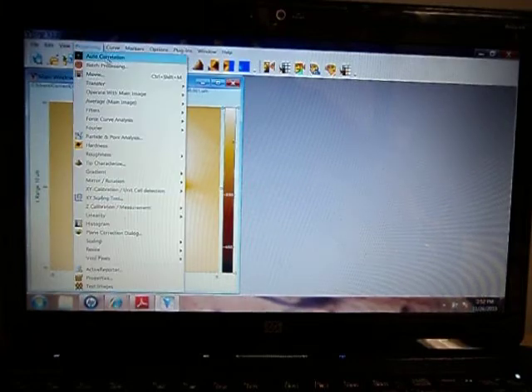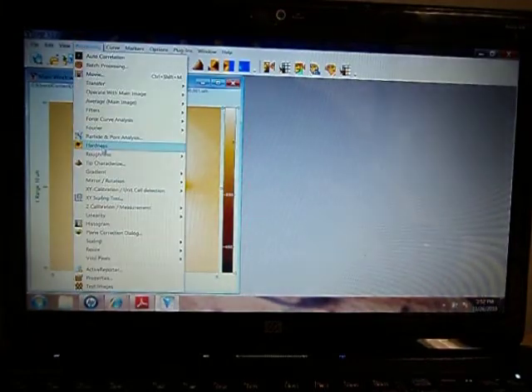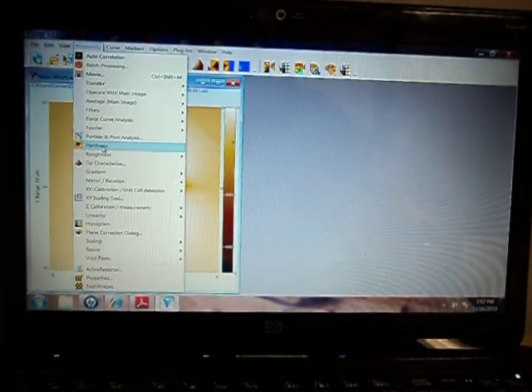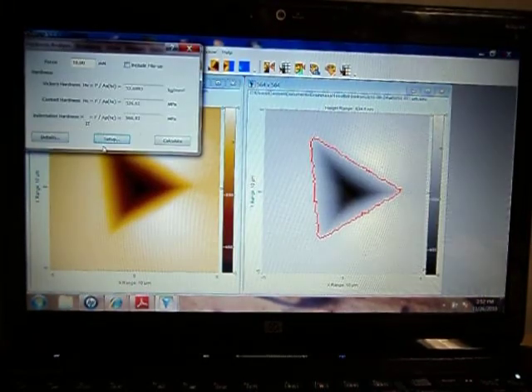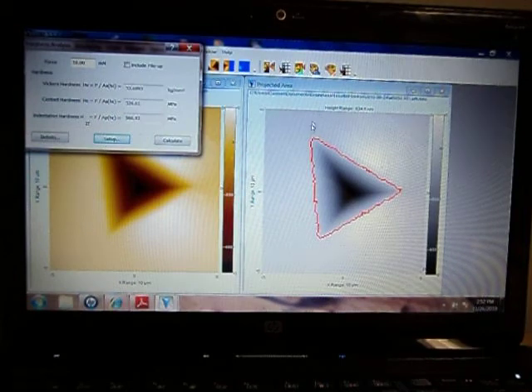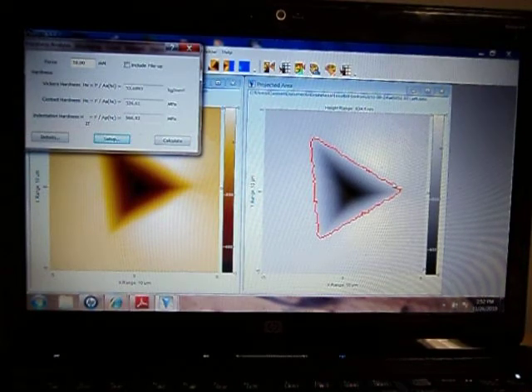To begin the analysis, go to Processing and click on the function Hardness. It automatically draws an outline around the indentation.